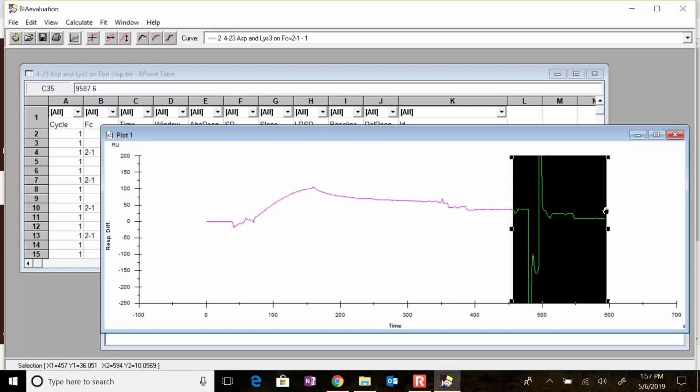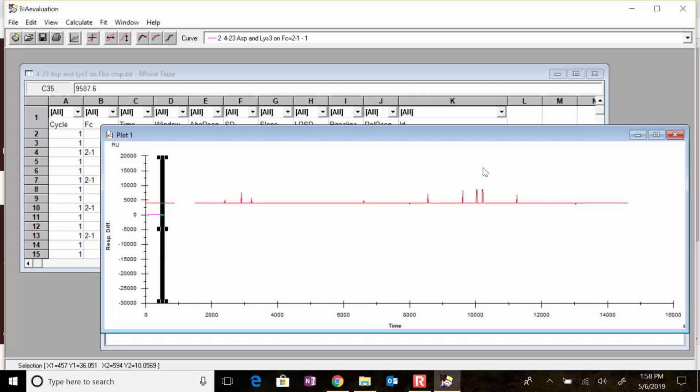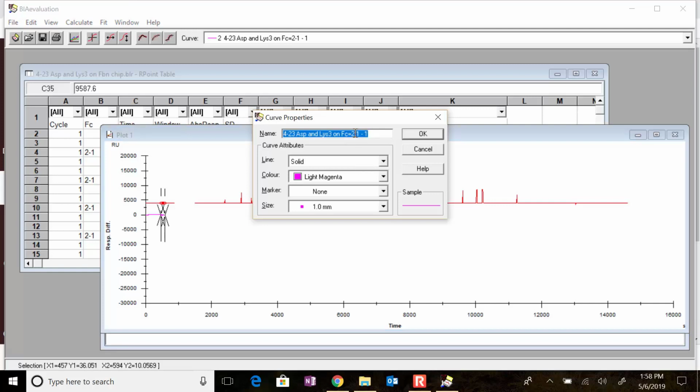Be a little bit careful when you do this, though, because I'm not sure in this situation if it would or wouldn't also cut out the data that's above it. I don't think there's any data above it, so I think it's okay. But just beware that strange things like that can happen. So that is our 800. Oh, and we need to do one more thing about that. We need to remember what it is.